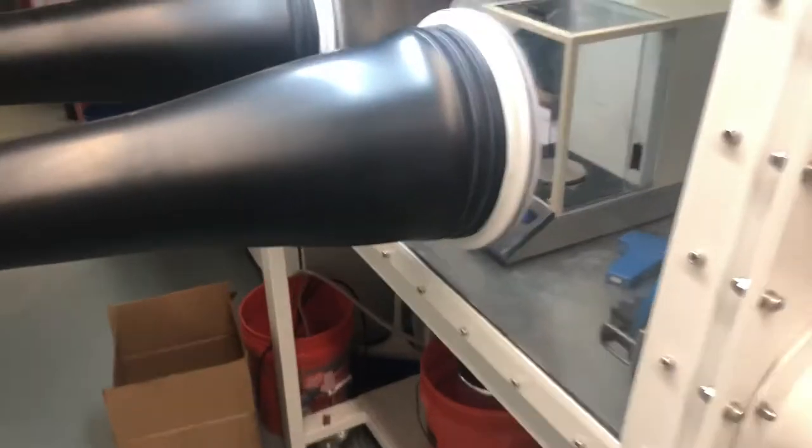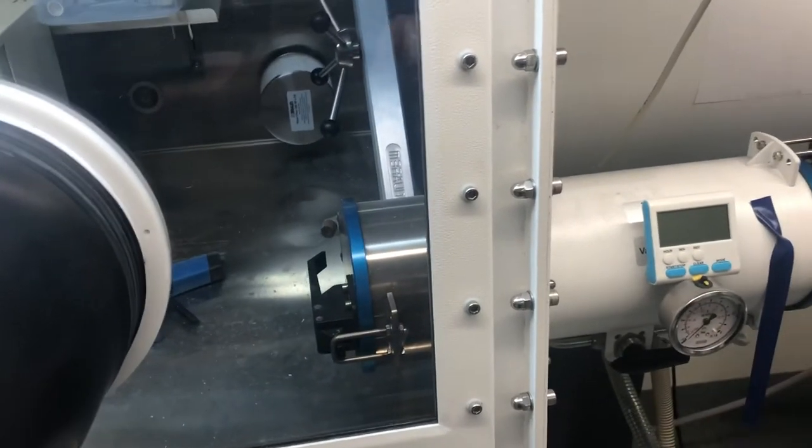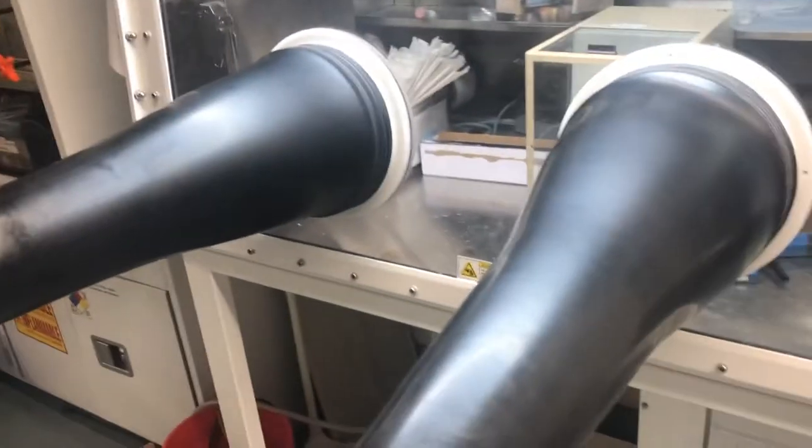When you are done on the glove box, you will put your items back into this. You open a door again, put your items in, seal the door behind it, and then you can pull your arms out of the glove box.